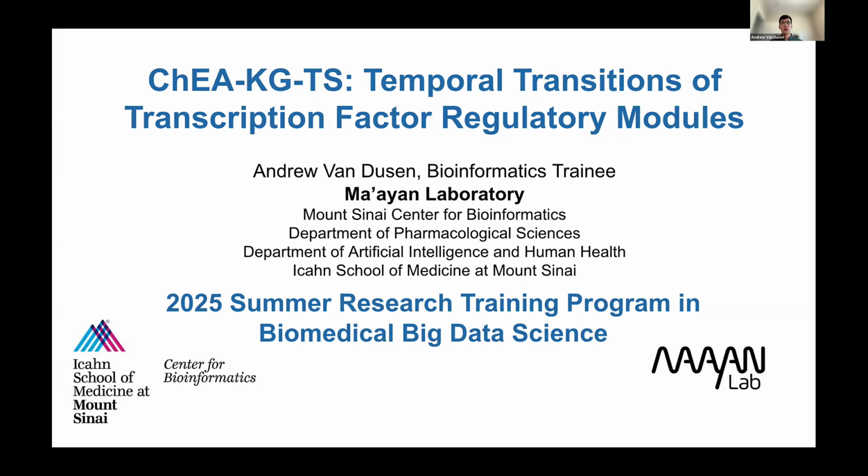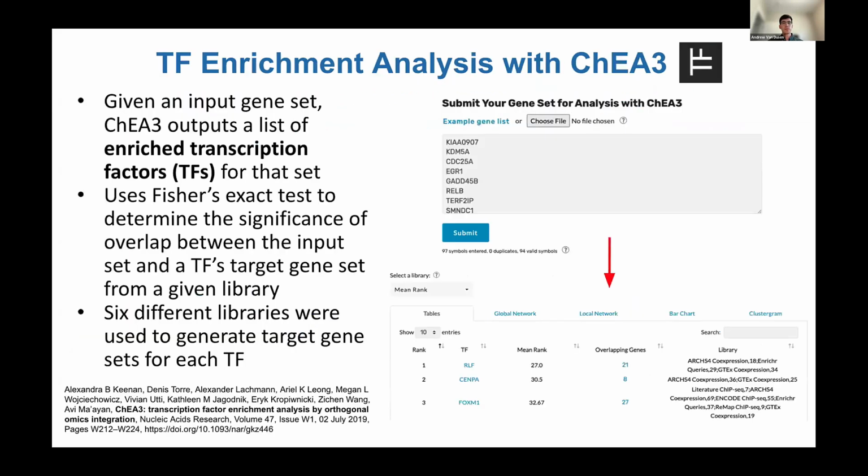Today, I'll be talking about a method and software application I worked on this summer to better understand how the transcription factors that are enriched at different time points within time series RNA-seq data regulate each other over time.